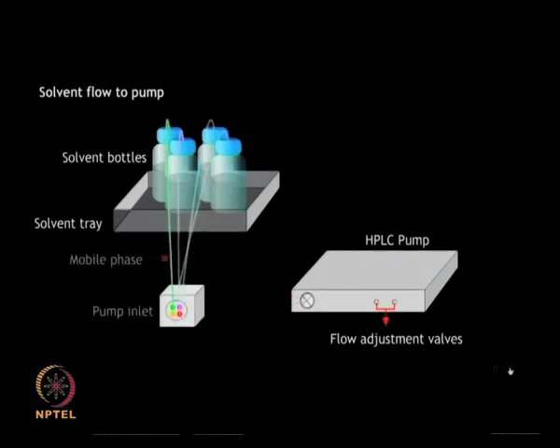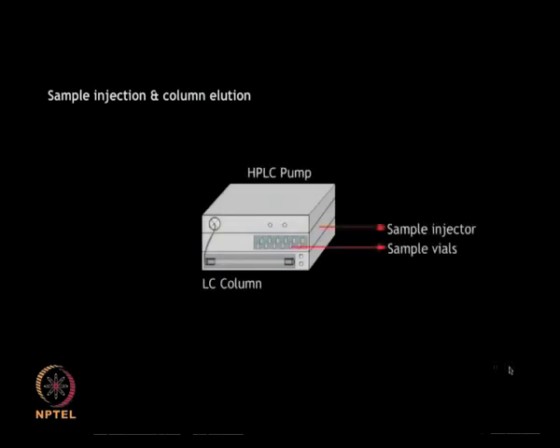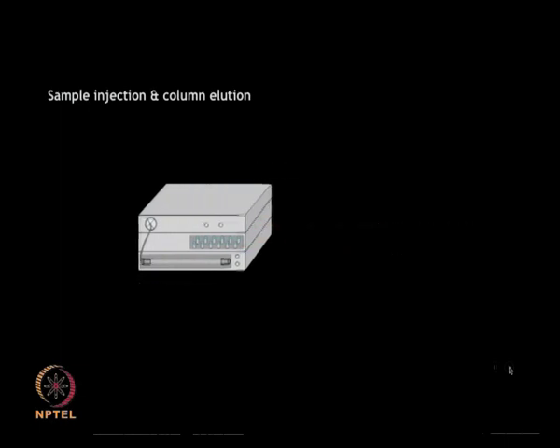Different solvents can be placed in the solvent bottles depending upon the purification requirements. These solvents are mixed in the desired ratio and pumped into the column during elution after removal of any trapped air inside by means of the degasifier.